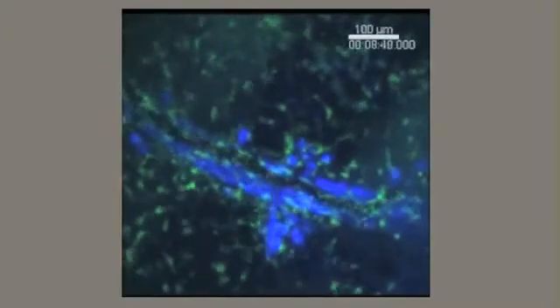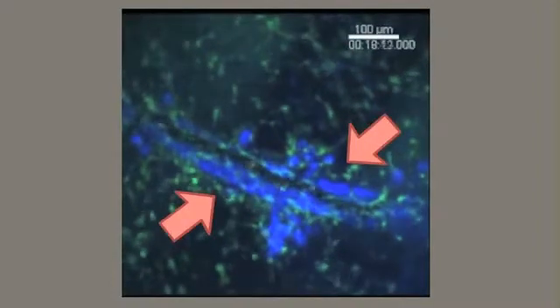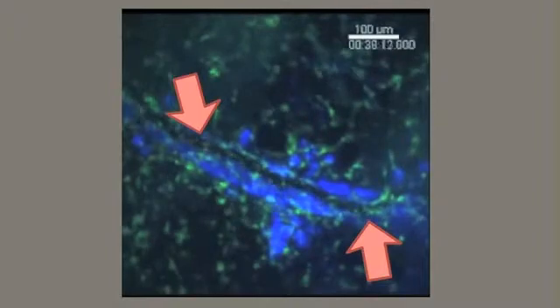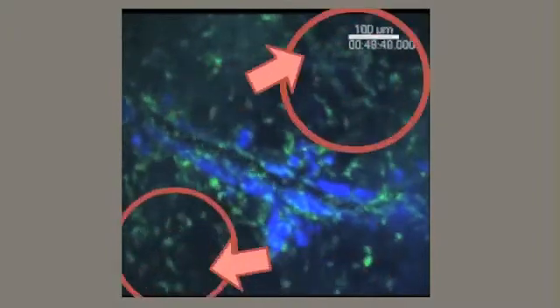The first video shows a normal breast duct in the middle of the field, blood vessels and inflammatory cells which move around in the blood vessels and the fat of the breast.